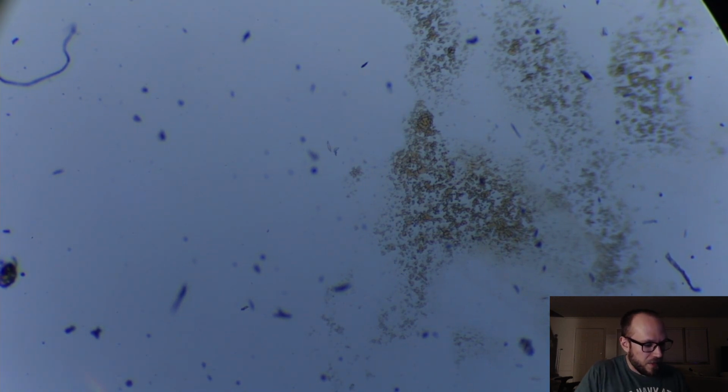Anyway, I think that's going to be it for tonight. I just wanted to do this for a little while, show off some of my cool microscopy slides, and see what's going on with that water, which I think I figured out. I'm going to upload this to YouTube, and I definitely intend to do some more microscopy stuff in the future, especially for the extra life stream as well.